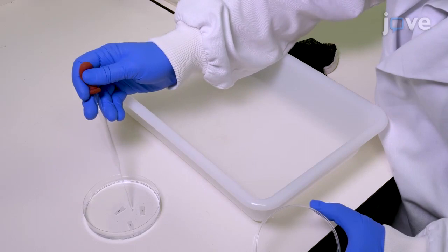This method can be applied to a variety of insect species of public health and agricultural importance, and its applications extend widely, from bacteria to mammalian cells.